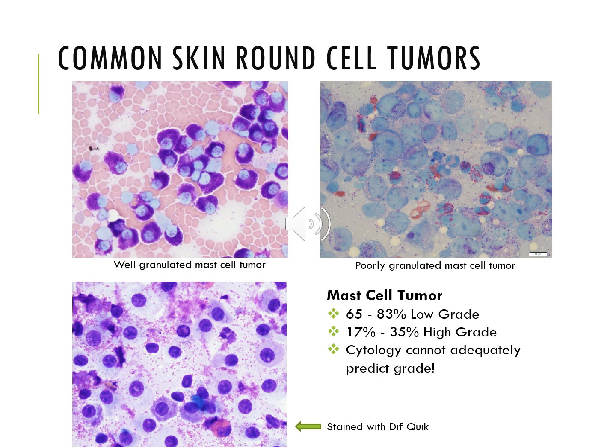tumor. And so you see these round nuclei, which have lightly basophilic nuclei, and then abundant purple granules all throughout the cytoplasm, sometimes covering the nucleus as well, but you can see all the granules. You can see that they're mast cells for certain. And so these are the ones that are pretty easy to diagnose. I really like reading these out on cytology.